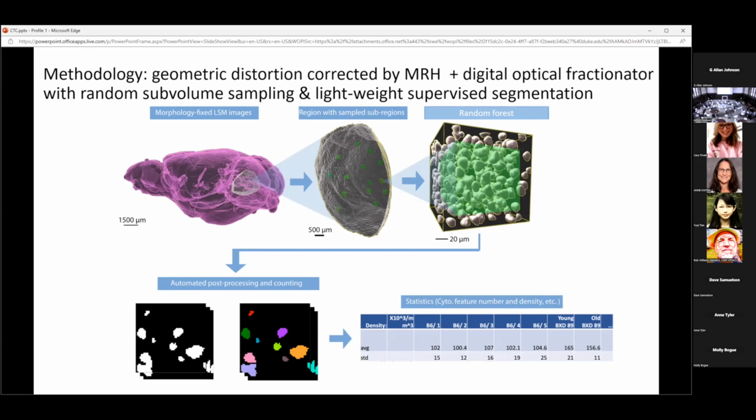These blobs of the neurons will then be sent to the post-processing part of the algorithm, which includes the three-dimensional watershed, the volume filter, and the unique blob labeling. And because the subvolumes are user-defined, our algorithm will actually output the density instead of the counts. And then the densities will be saved into files.